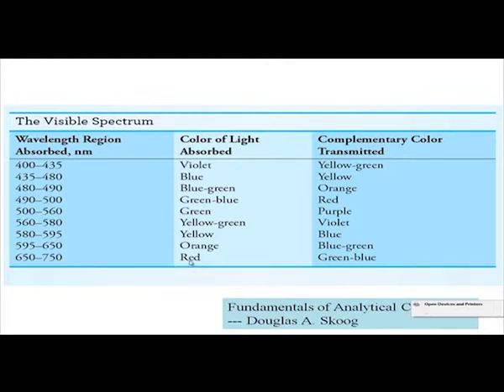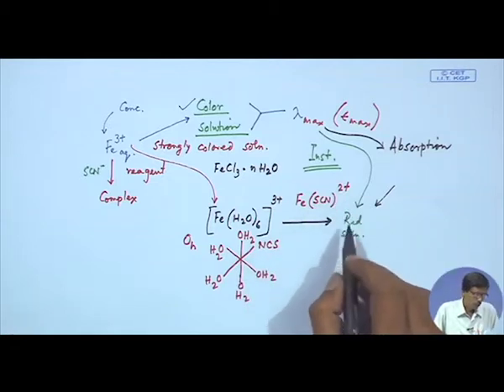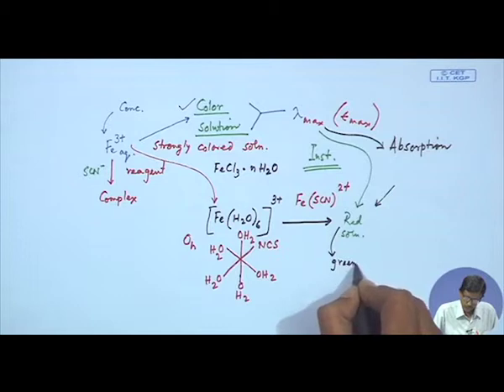So, this is the broadest range, which is the red range, that particular absorption. If the red is absorbed, we know a large number of solutions, from the dissolution of the metal ion, are green or blue in color. Once the FeSCN2+ is forming, this is giving you the red color, which means you have the corresponding absorption in green to yellow green.